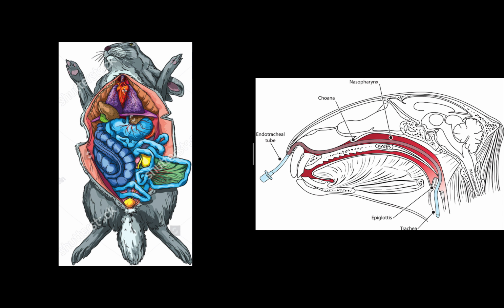Red blood cells traveling through the capillaries is what makes it possible for oxygen and carbon dioxide to diffuse or move freely between the respiratory system and the bloodstream. Oxygen molecules attach to the red blood cells, which travel back into the heart at the same time the carbon dioxide molecules are blown out of the body with the next exhalation.